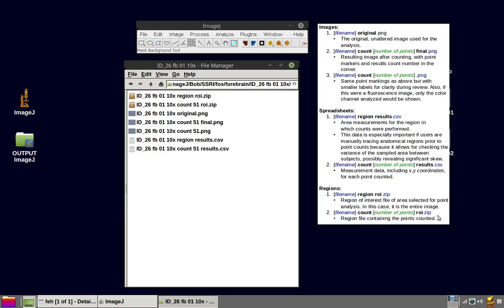And the most interesting region is filename count, number of points, roi.zip. And this region actually contains the points that we counted. Let's see how this region here can be used.